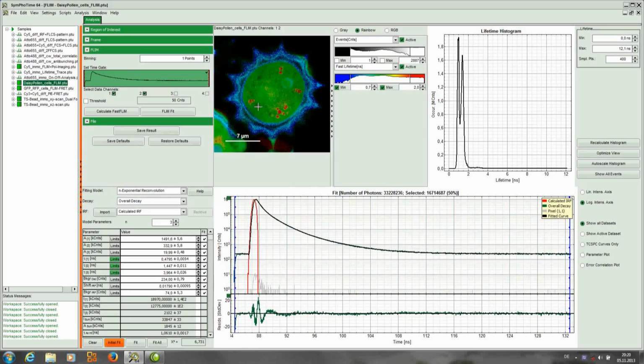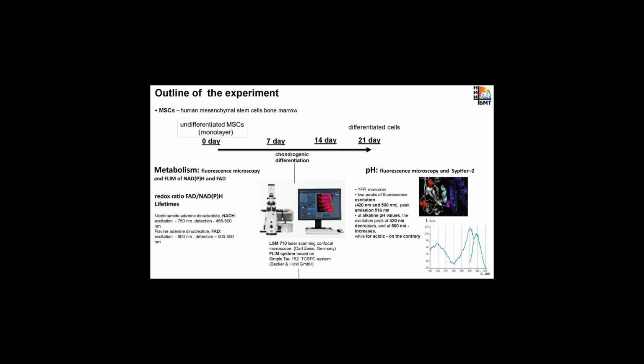Besides experimental difficulties, including the wavelength-dependent instrument response function, mathematical treatment of the iterative deconvolution problem is not straightforward, and it is a slow process which in the early days of FLIM made it impractical for a pixel-by-pixel analysis. Non-fitting methods are attractive because they offer a very fast solution to lifetime estimation. One of the major and straightforward techniques in this category is the rapid lifetime determination (RLD) method.